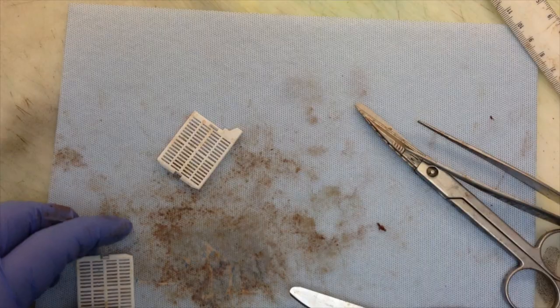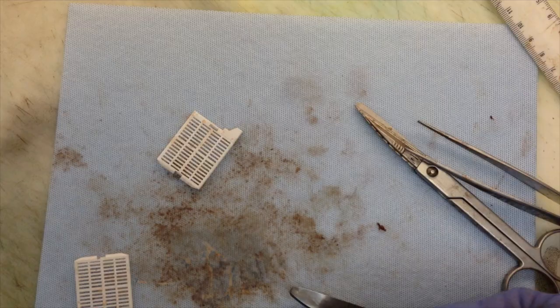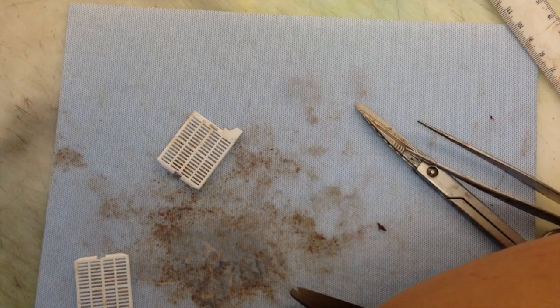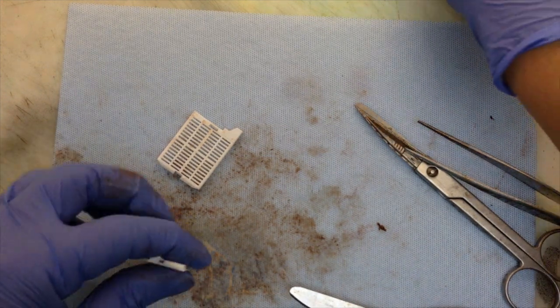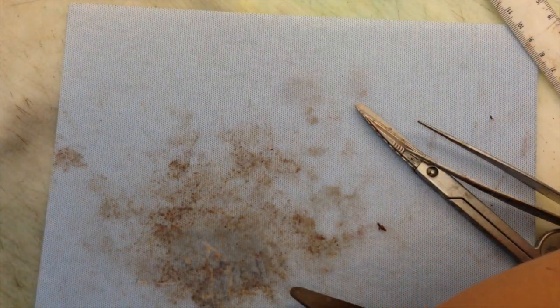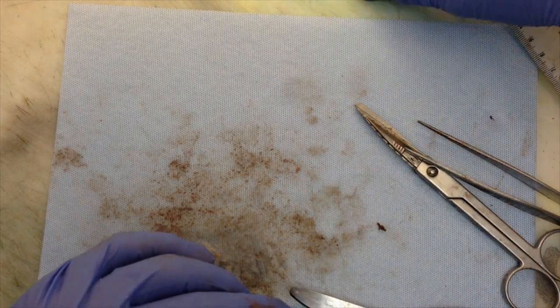New paragraph. Cassette summary: A1, anterior cervix with polyp. A2, posterior cervix. A3, sorry, this is part B, so this is B3, anterior endomyometrium with nodules. B4, additional endometrium anterior. B5, posterior endomyometrium with nodule. B6, additional posterior endometrium. B7, subserosal nodule. B8, fimbria and fallopian tube. B9 and B10, sections of cystic ovary.